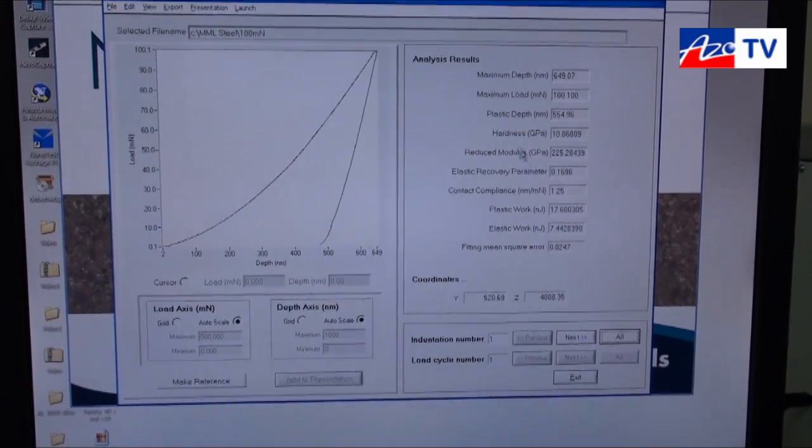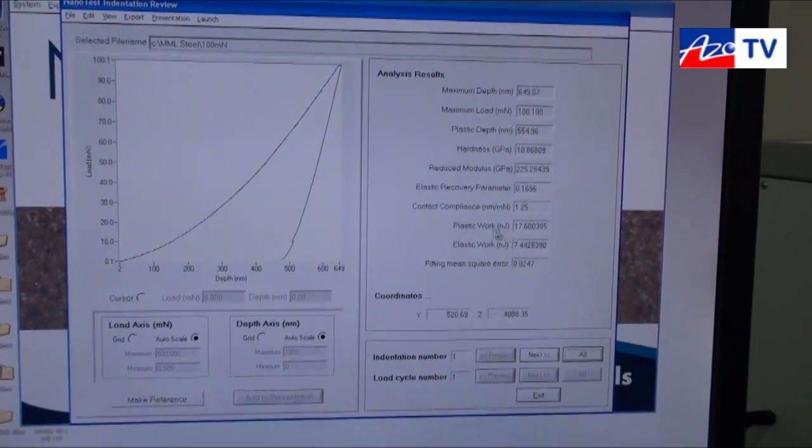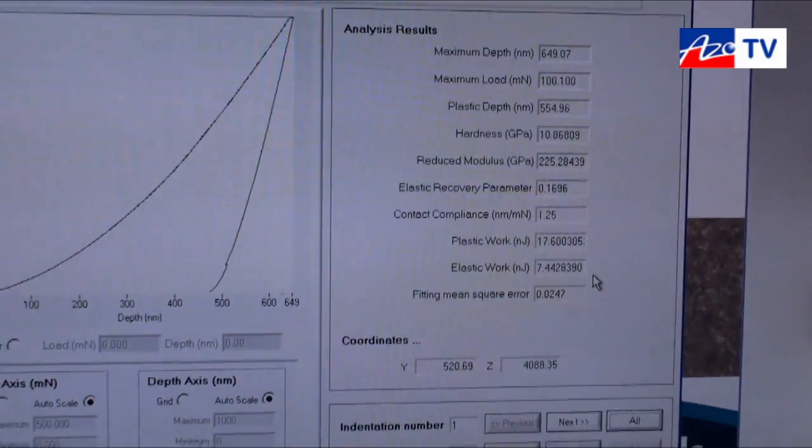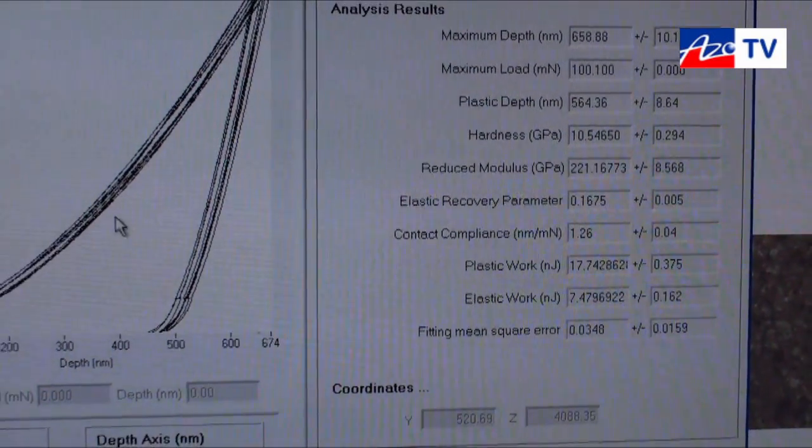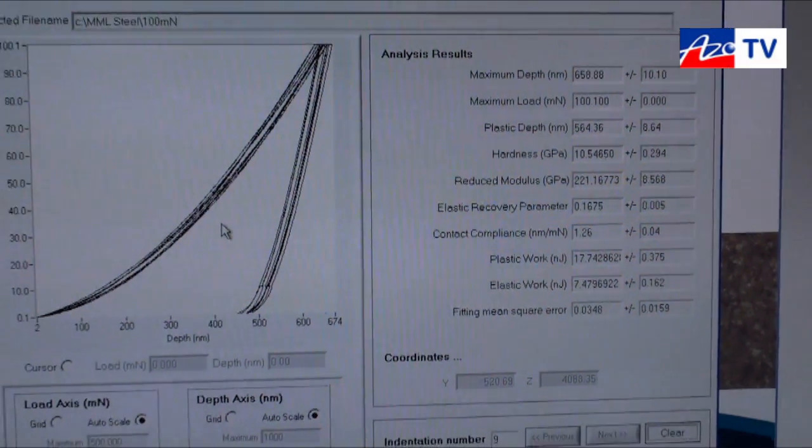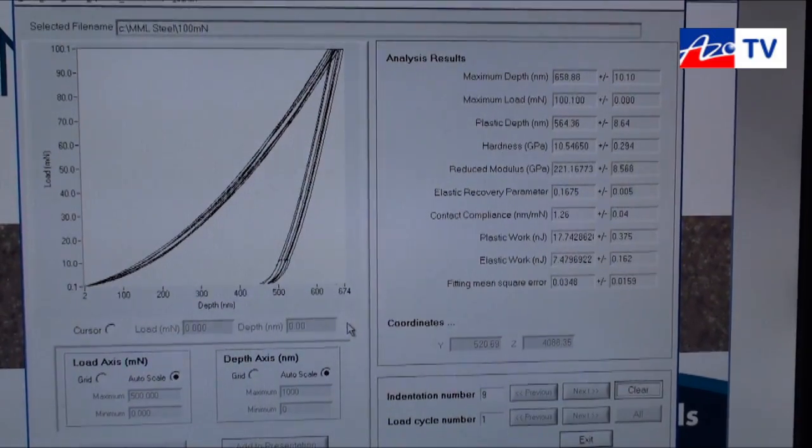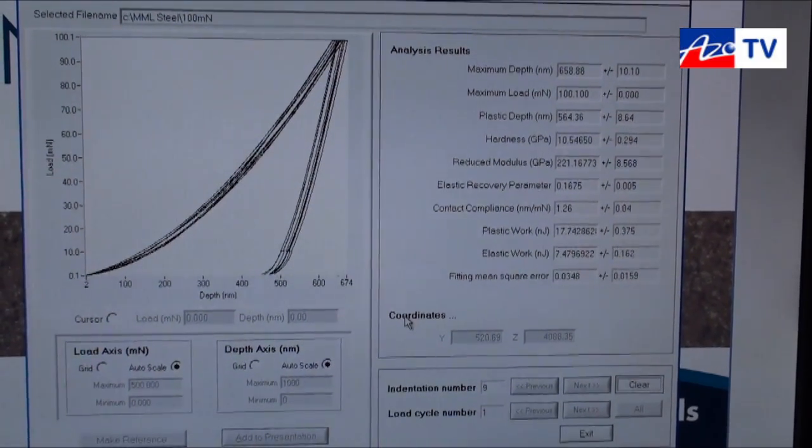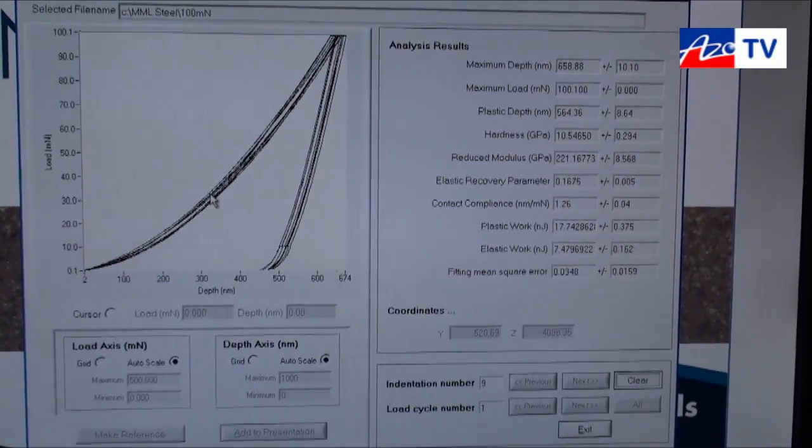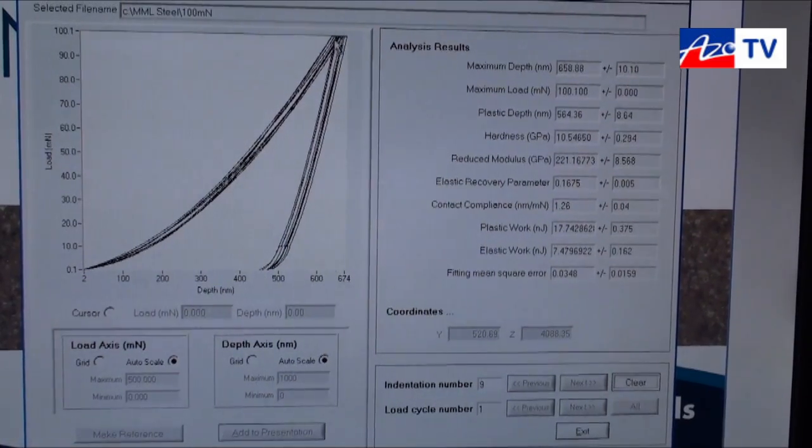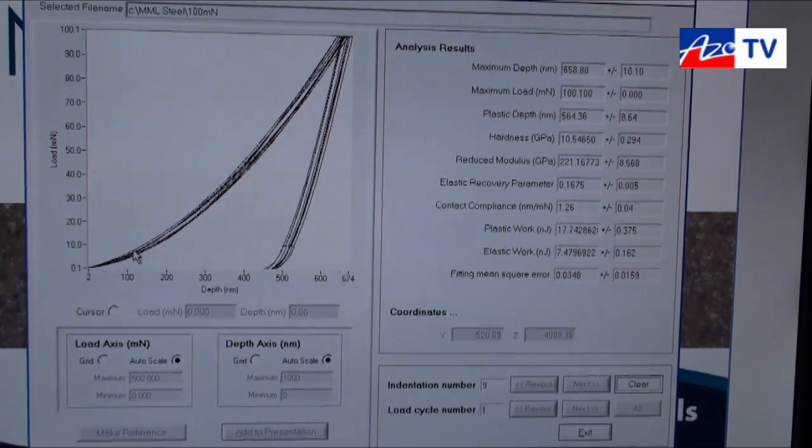We can analyze that data to look at things like hardness, elastic modulus, and then the plastic and elastic work done during the indentation. Typically people don't just do one indentation, so we do a set of indentations. In this case, because it's just a bulk sample, we're looking at the homogeneity of the properties across the sample surface. The results are pretty good, so we've got good grouping on the indentation results there. Any scatter is probably due to a bit of residual surface roughness on the steel sample.